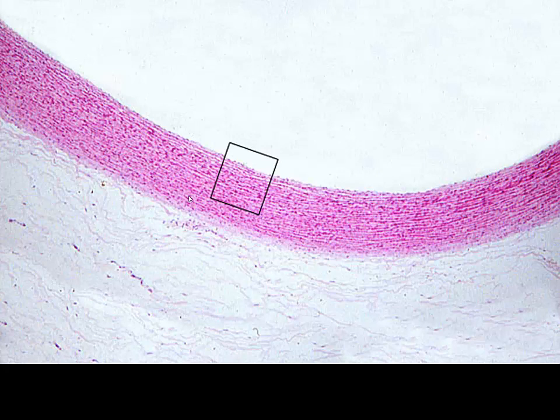All right, again, looking at different layers. Let's follow this inset. Again, we have our endothelium on the right, tunica intima, which would include the subendothelial layer, and then a lot of smooth muscle present here. Now, this is difficult because we didn't really see how big this lumen was. So it's difficult for us to really classify this vessel just on the images that we've seen so far.